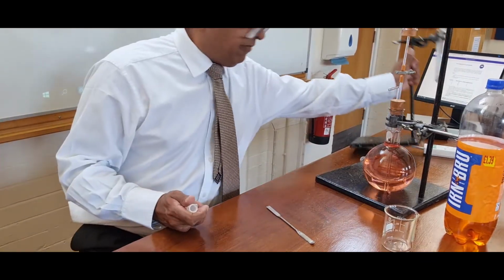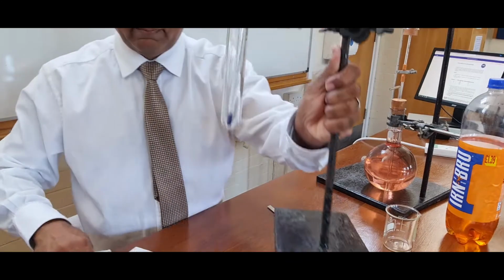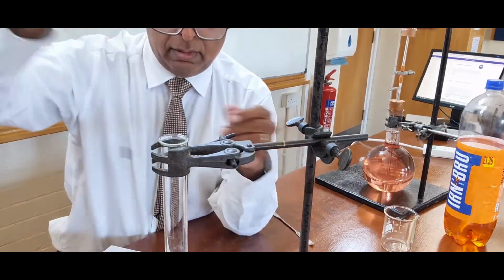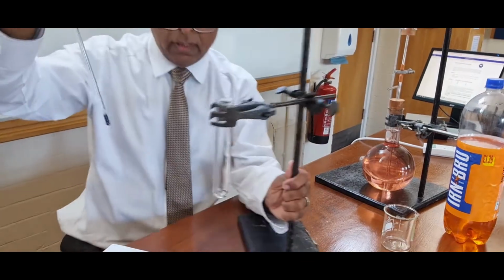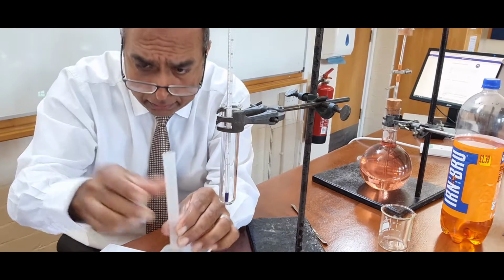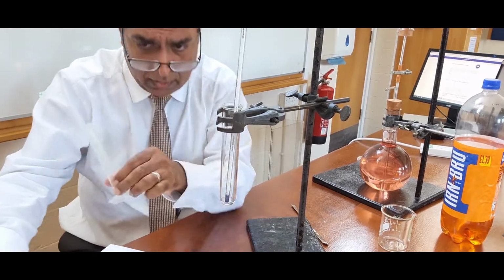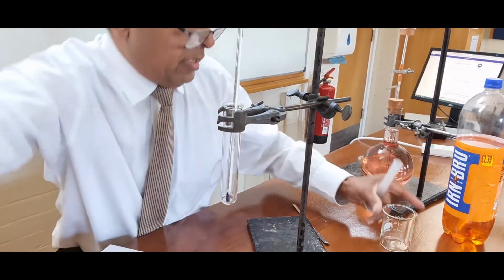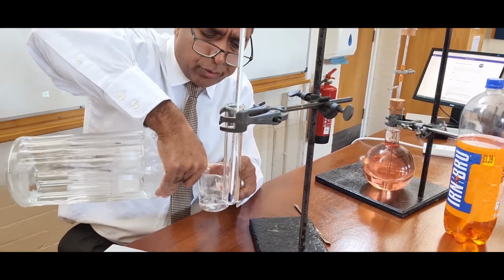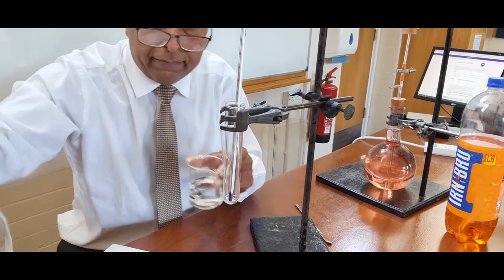Now, I take a thermometer and a boiling tube, and I've got a little measuring cylinder here. With the measuring cylinder, I can measure out 5 cubic centimetres of distilled water.